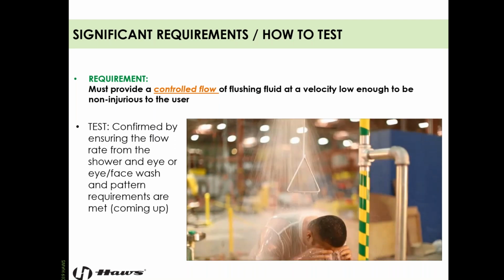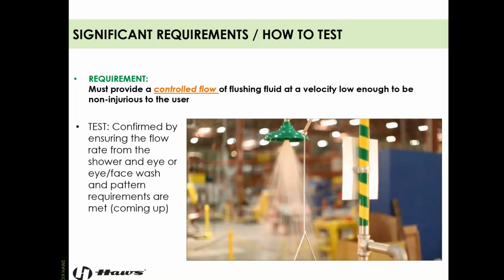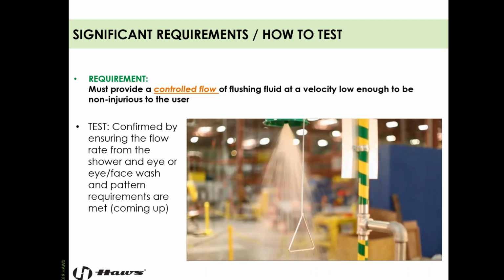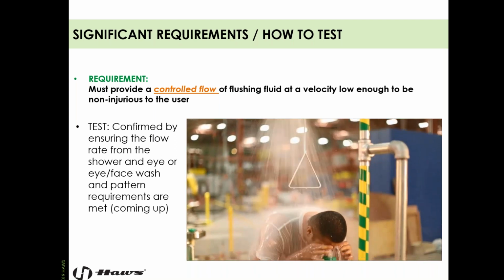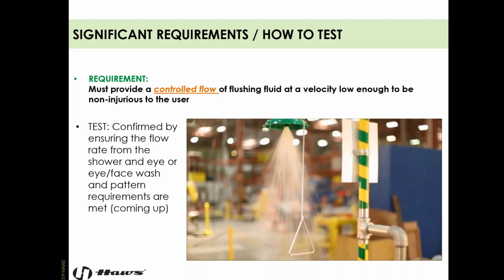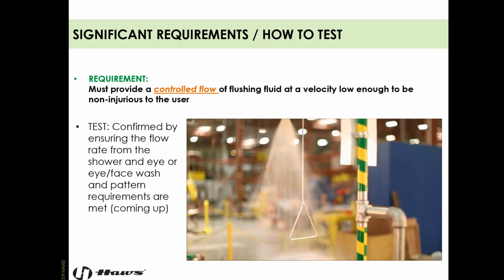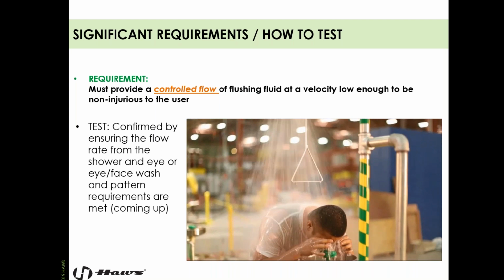Like I said, if you're already compromised, you're already in an immense amount of pain. Some people would rather deal with the hazard than with an excessive amount of water coming out of the eye wash. I like to call them brain washers. You get these eye washes that shoot like 20 feet in each direction, super strong streams. There's no way anybody's going to put their face in that and have a comfortable experience, let alone not do damage to the sensitive tissue of your eyeballs. So confirming this by testing the flow rate of the equipment and the flow pattern of the water coming out of that equipment is also incredibly important.